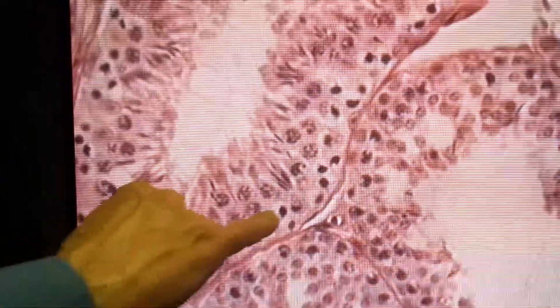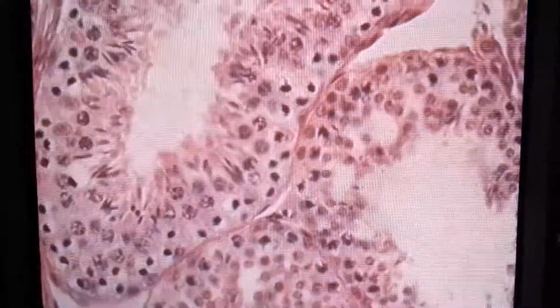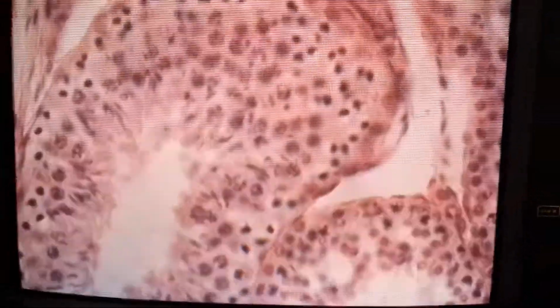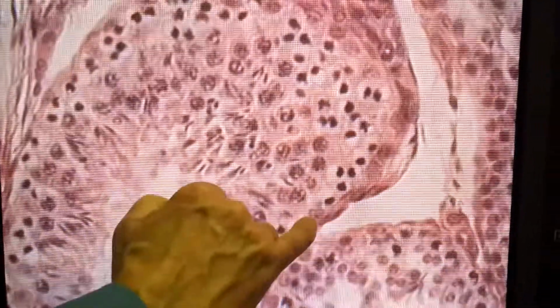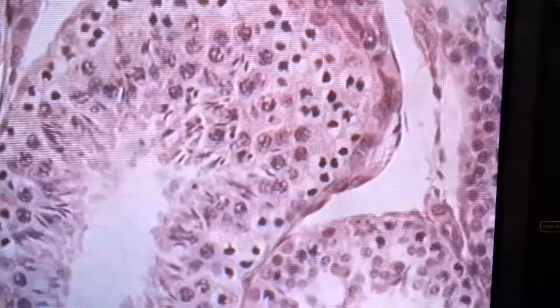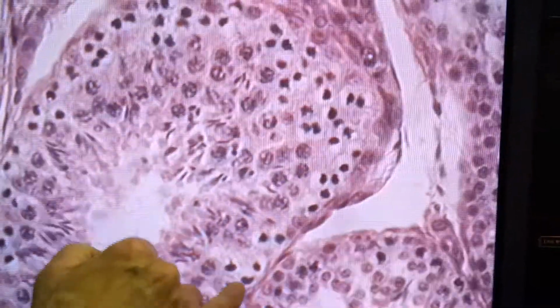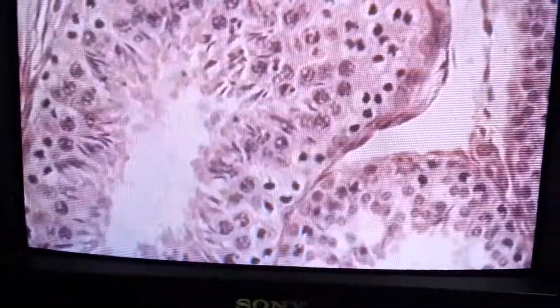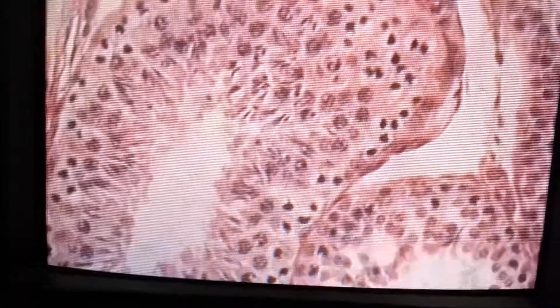So here you have these spermatogonia that are very heavily stained on the outside, and then you have these Sertoli cell nuclei, which are well defined, but tend to be lightly stained and irregularly shaped. Like here's a Sertoli cell nucleus. There's actually one further down. Yeah, here's a Sertoli cell nucleus, I think, on the side, in the corner. Fantastic.